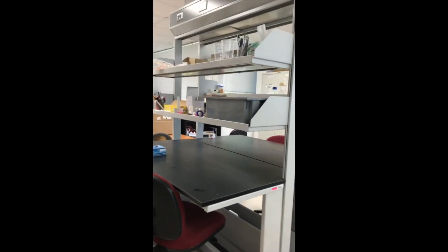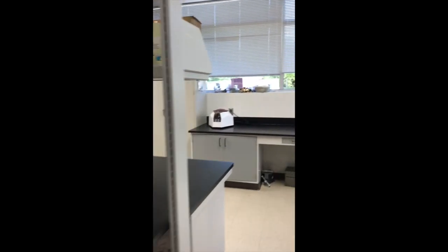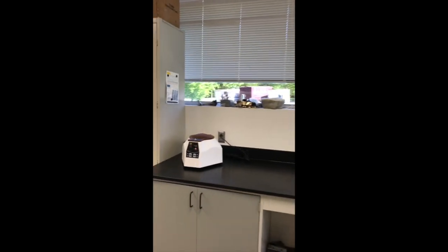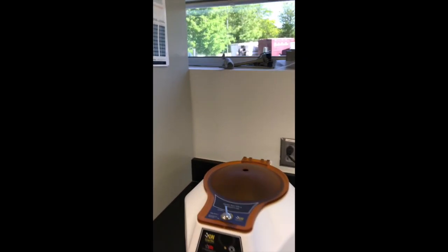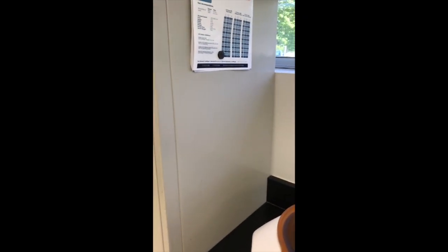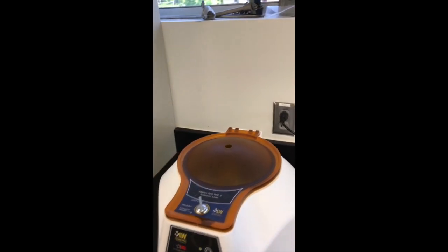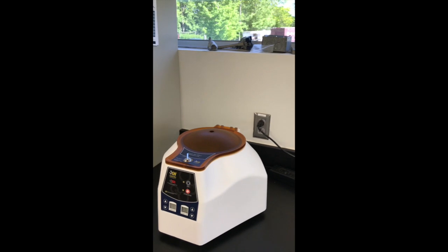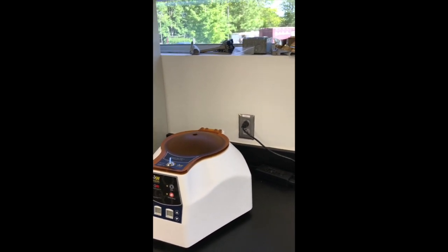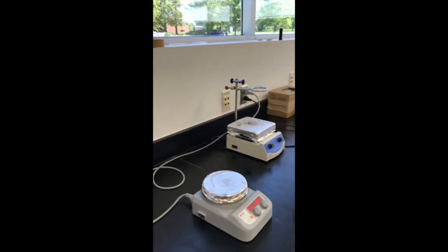And on this side, it's our bench top. We do all kinds of research on our bench, so our students did a good job cleaning it right now. It's very clean. And this is our centrifuge. Basically, if we want to separate it, we can spin it in this little chamber. And then we put a sample inside here, and then we spin it, we can separate our material apart because they have different densities. And then when you spin it, the heavy ones will go to the bottom of your container first.